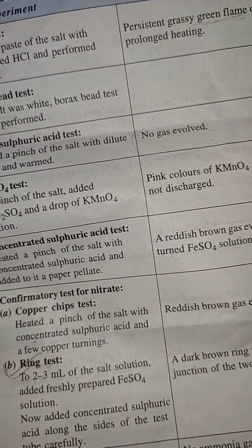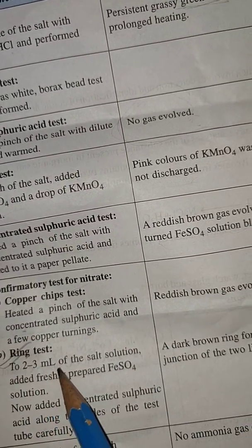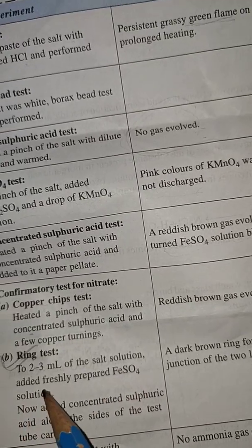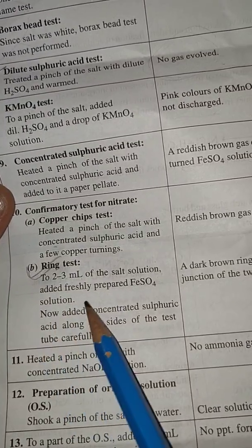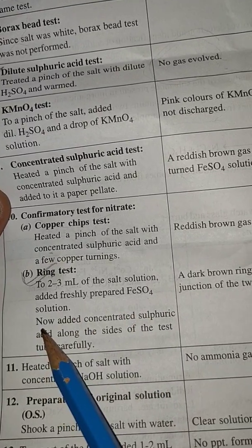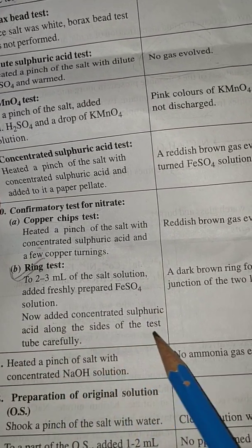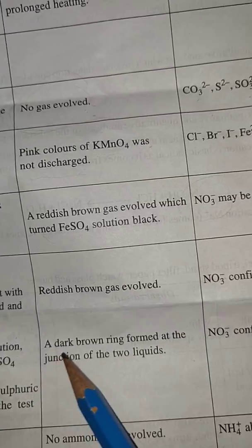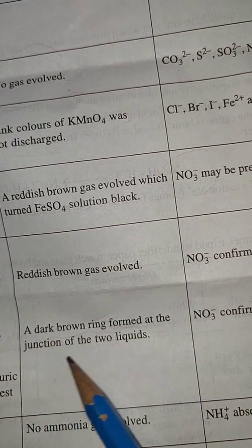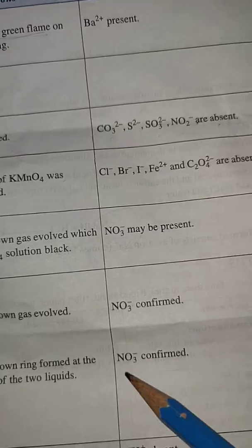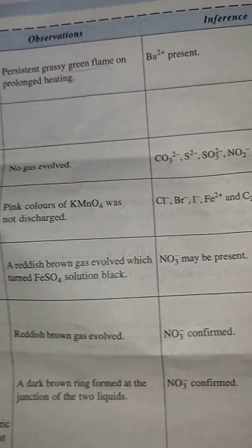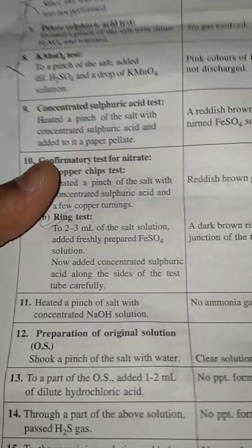The most important is ring test: take two or three ml of salt solution and add freshly prepared FeSO4 solution. Now add concentrated sulfuric acid along the side of the test tube carefully. A dark brown ring formed at the junction of the two liquids. NO3⁻ is confirmed.